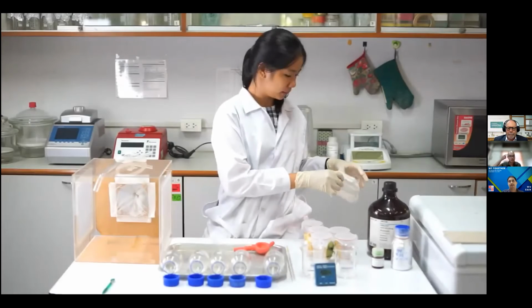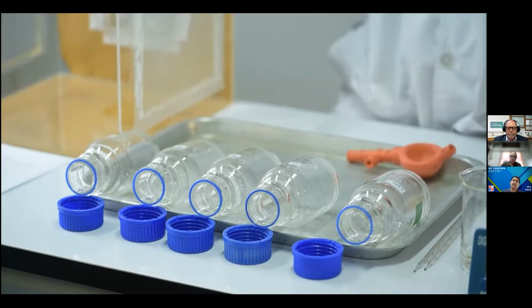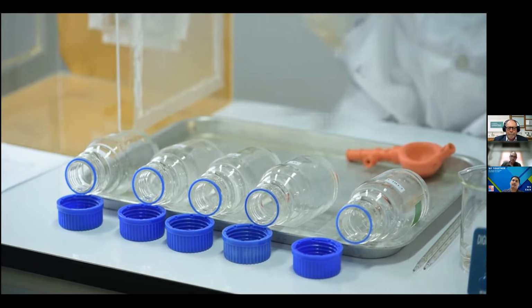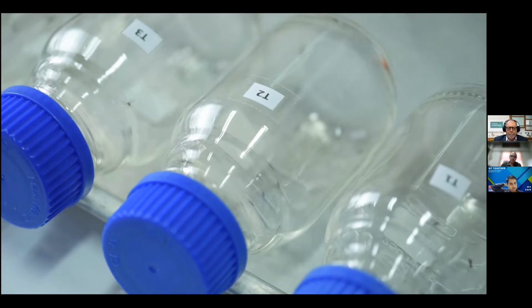The bioassay can be performed with the bottles either in an upright position or with the bottles lying on their sides, but you have to be consistent. If you start with the bottles in an upright position, keep doing so. Next, introduce 10 to 25 mosquitoes into each of the control and treatment bottles.